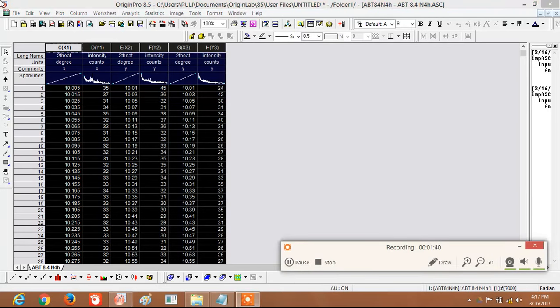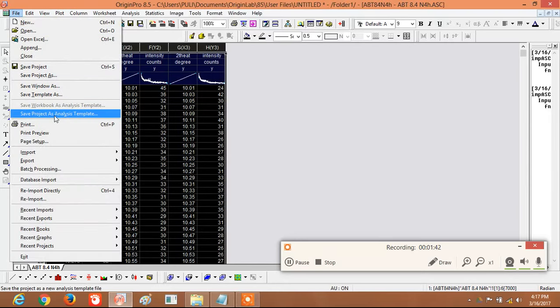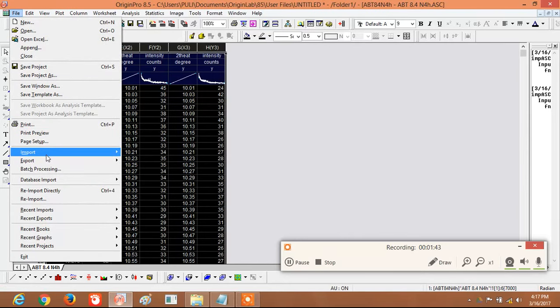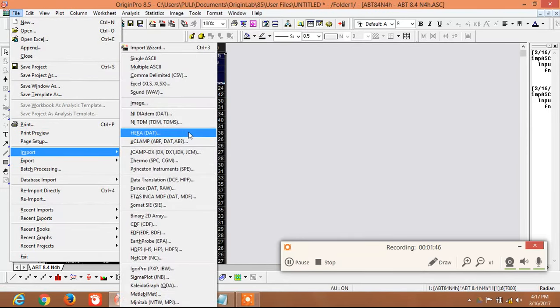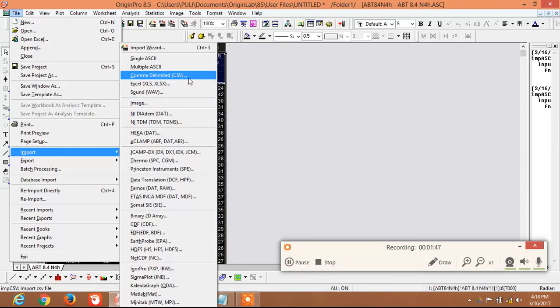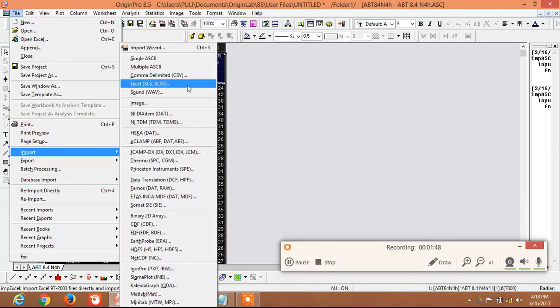Similarly, by using the Import function, Excel files can also be uploaded in a similar way.